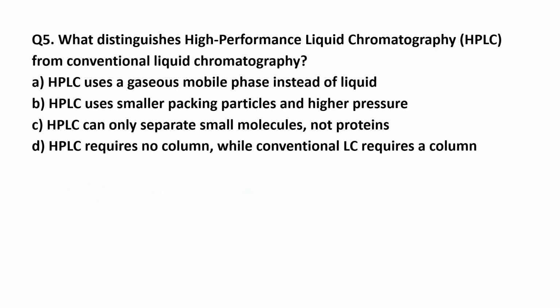What distinguishes high performance liquid chromatography from conventional liquid chromatography?